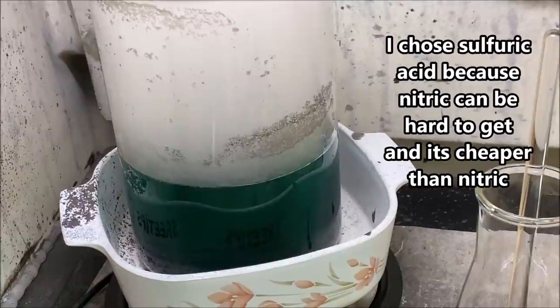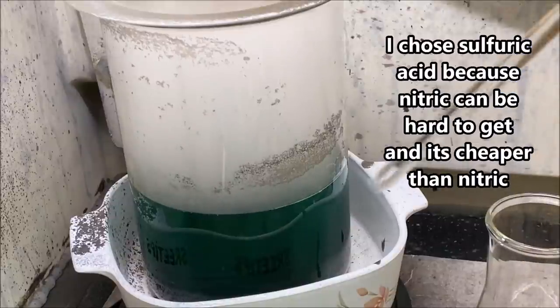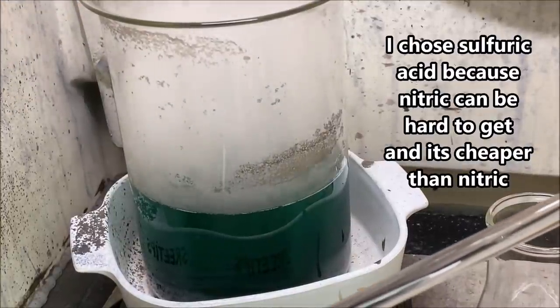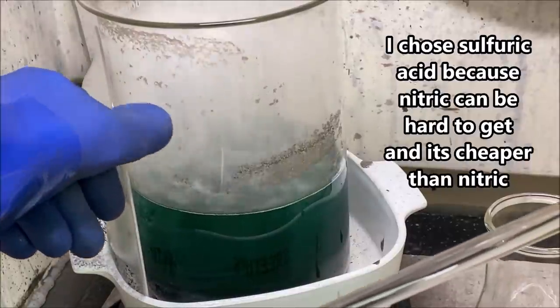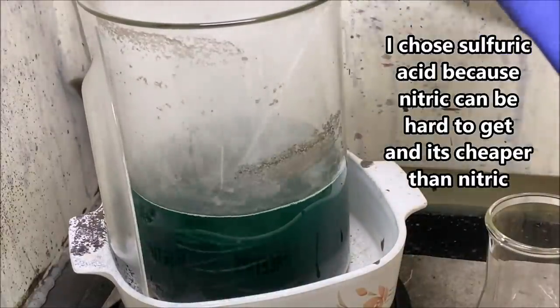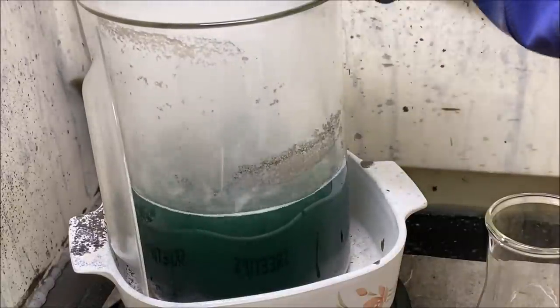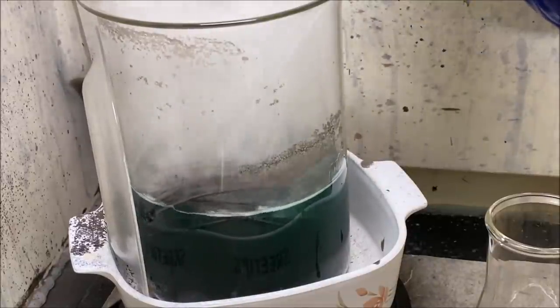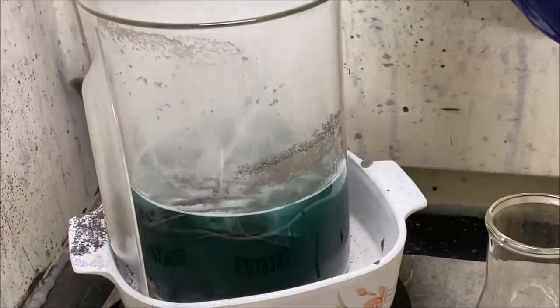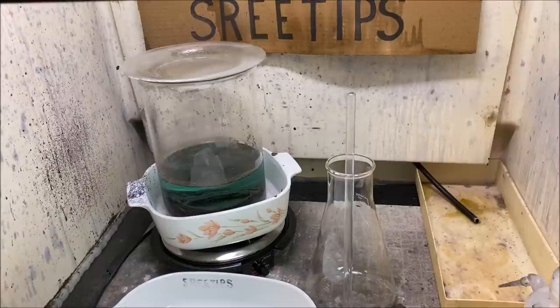This has been boiling now for about 16 hours. I'm going to reach down in here with a glass rod to check on the wire and see what we've got. I do not like working with boiling sulfuric acid. As you can see, there's still plenty of wire left that needs to dissolve completely before we can go forward, so I'm going to let this continue to heat up and dissolve in the concentrated sulfuric acid.